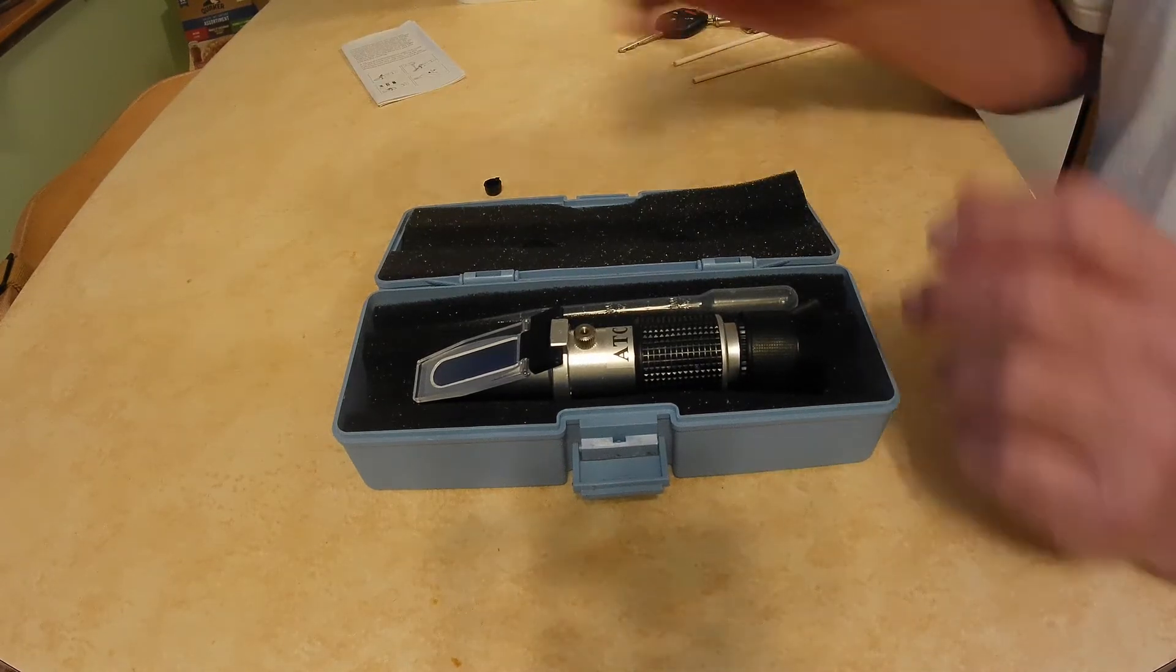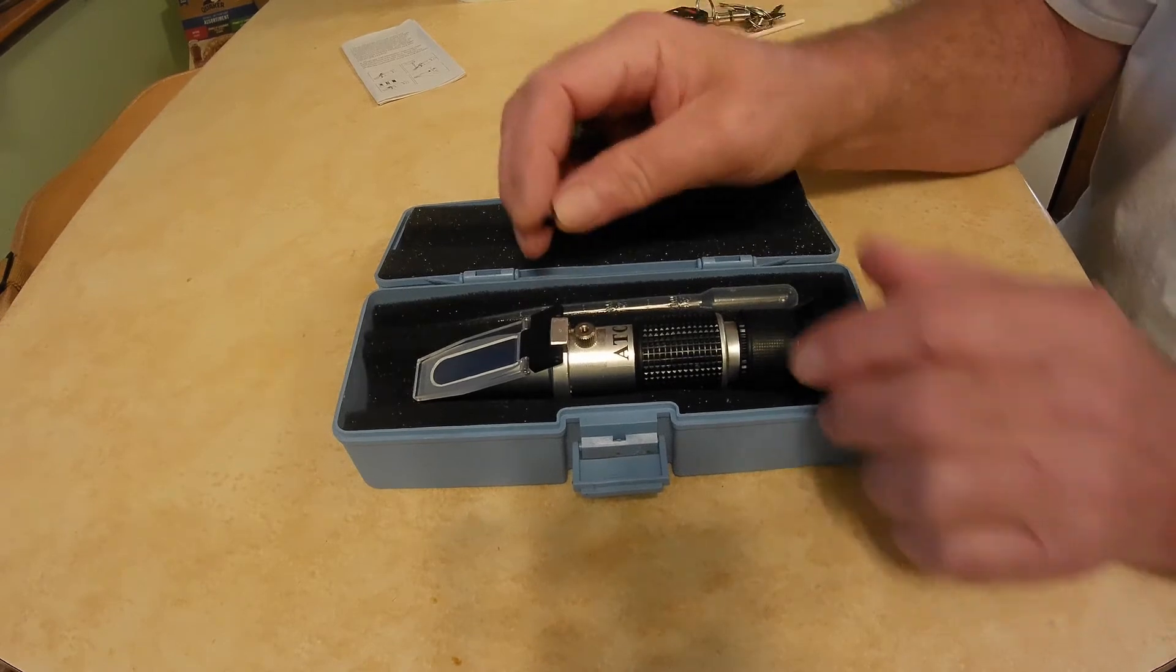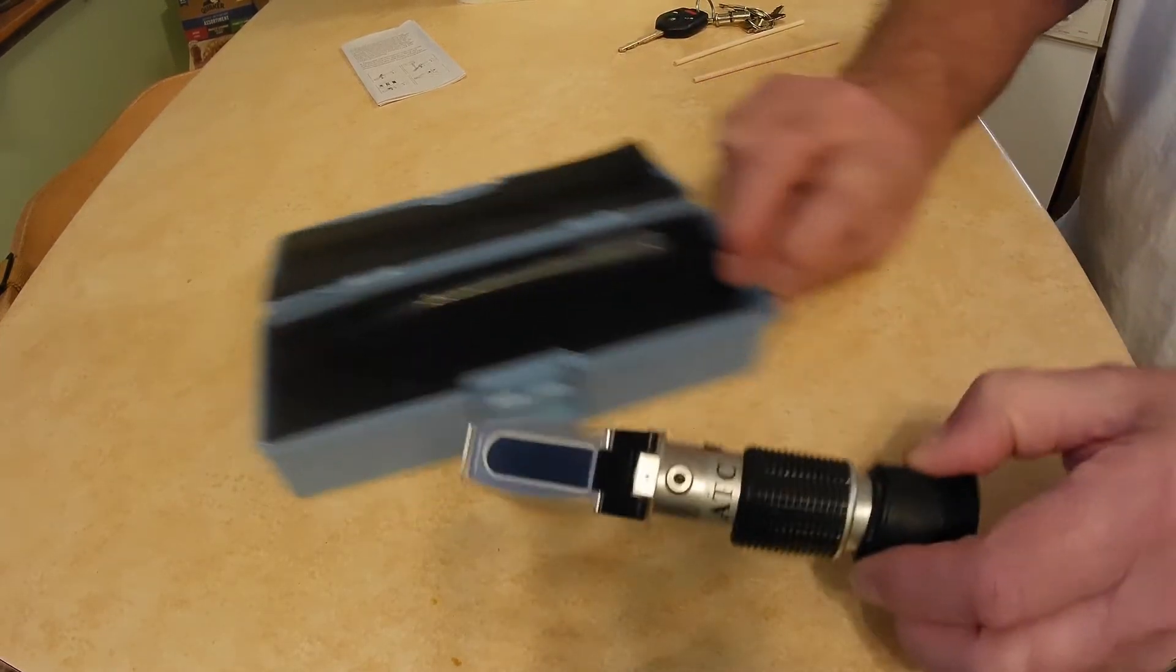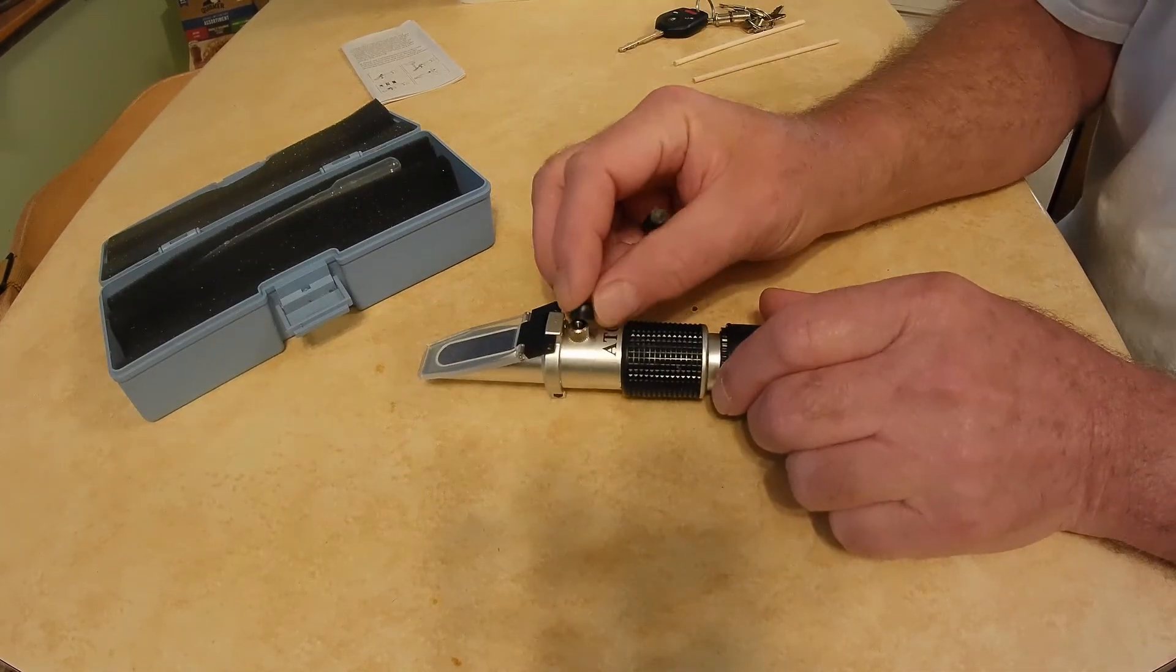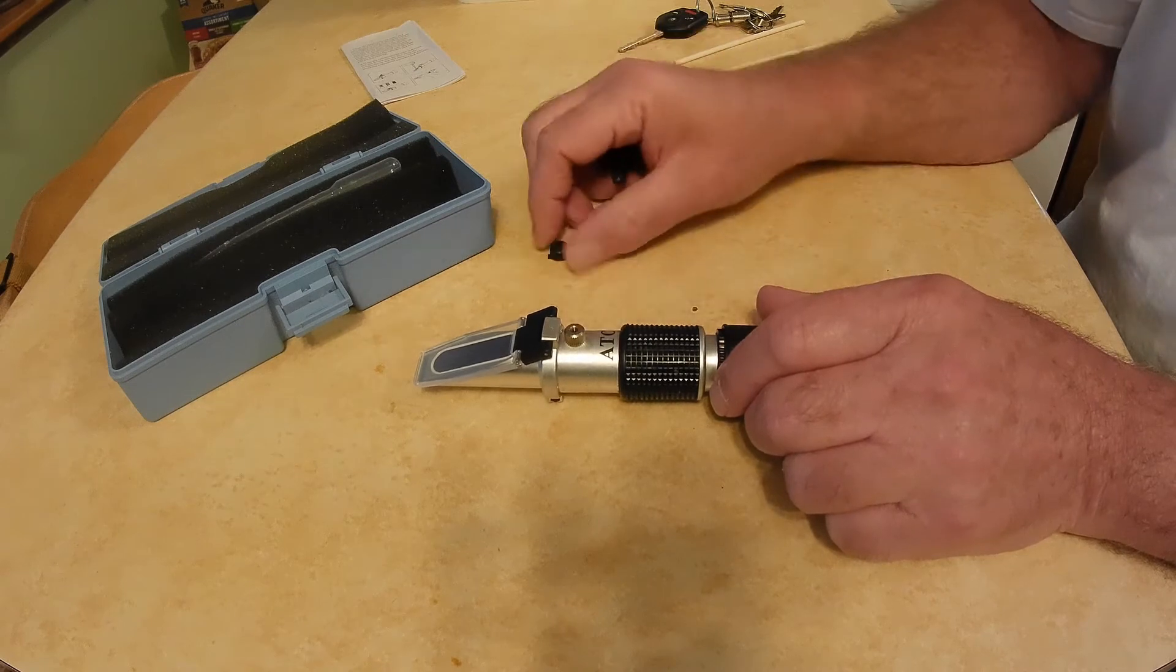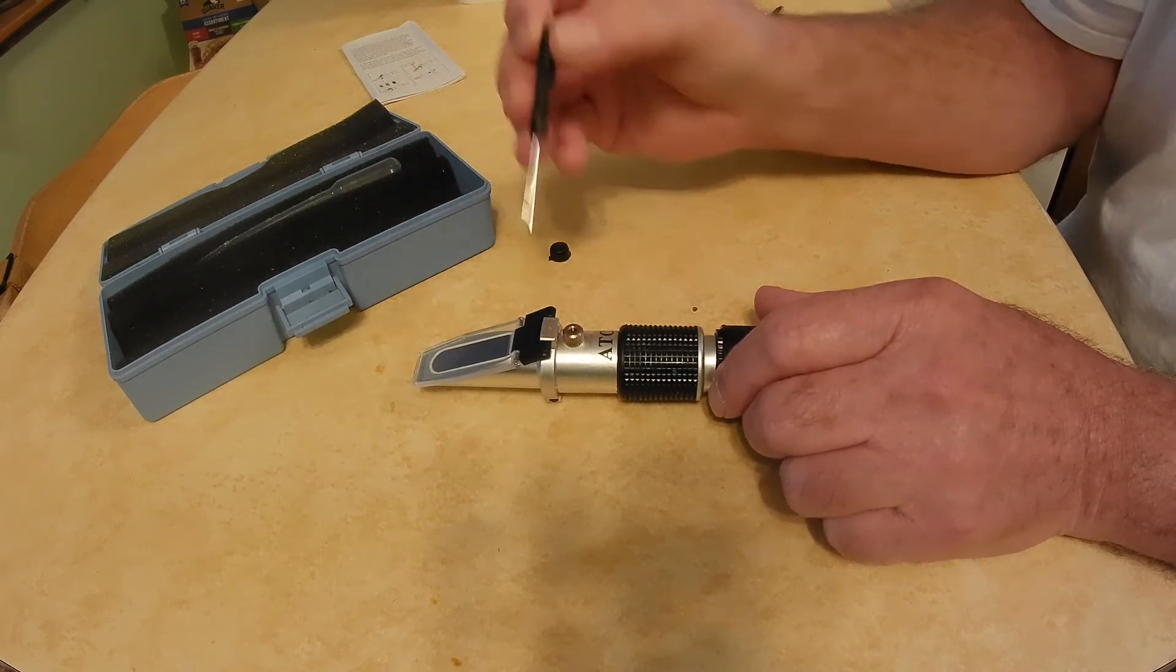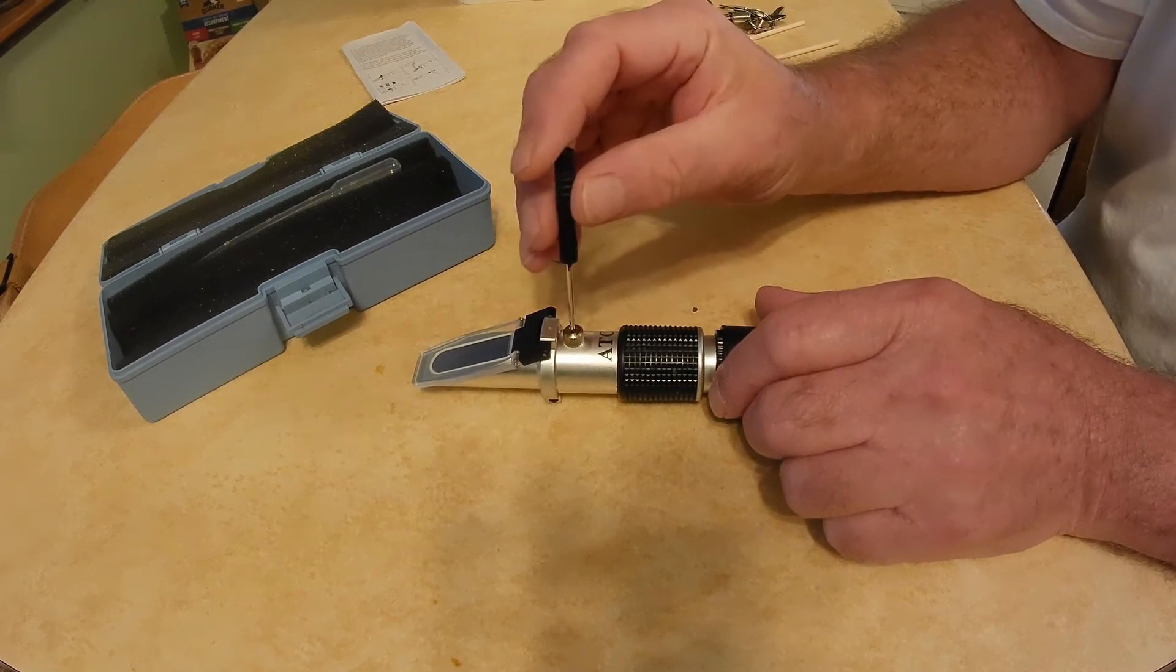And to calibrate them, there's this little rubber cover. Take it out of the box. There's this little rubber cover that goes over this device here, and then you get a little screwdriver with the kit and you put it down in there and turn the adjusting screw.